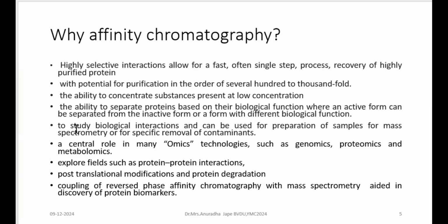It also has the ability to separate proteins based on their biological function, where the active form can be separated from the inactive form. You are aware that various enzymes and proteins are present in various structural forms, and the structural form will decide whether it is going to be functioning or non-functioning, and of course it is regulated by the microenvironment. But when you want to purify or differentiate the active from the inactive one, different biological forms, you can take help of affinity chromatography.